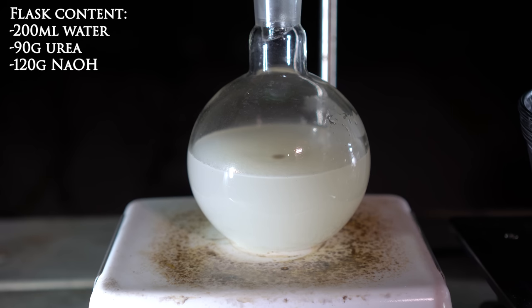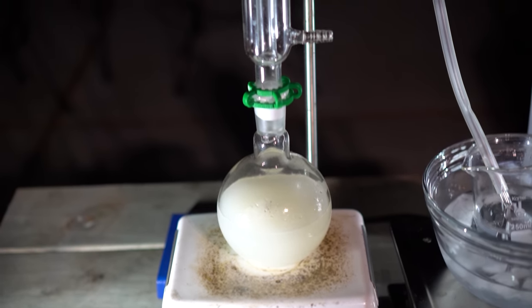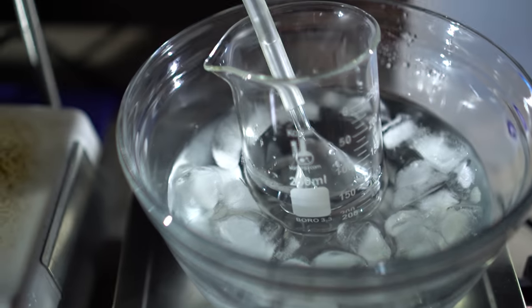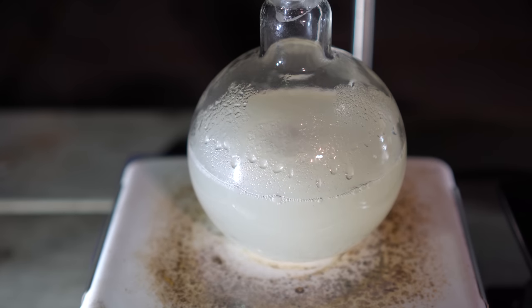In a flat-bottom boiling flask I added 200 mL of water, 90 grams of urea, and 120 grams of sodium hydroxide. This reaction makes sodium carbonate and releases ammonia gas, which can then be bubbled into water to make an aqueous ammonia solution. I set up for a reflux with a gas inlet adapter at the top; a tube was attached to the top and a funnel to the bottom to bubble the ammonia gas into the water. I heated up the flask and you can see the ammonia slowly start to bubble into the water. It's a good idea to cool the collection flask as much as you can, as this increases the solubility of the ammonia gas.